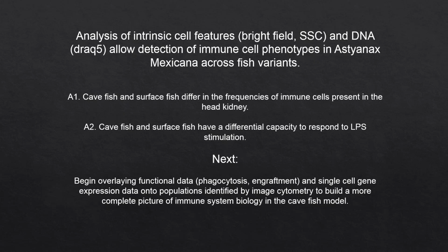And similarly, like single cell RNA-seq, to try and understand where we can overlay some gene expression matrices onto some of the populations we see by morphology. Because obviously the morphology data by itself is not going to capture differences. T cells and B cells both pretty much look the same by this assay, but I think we can dissect that out a little bit more with other approaches.